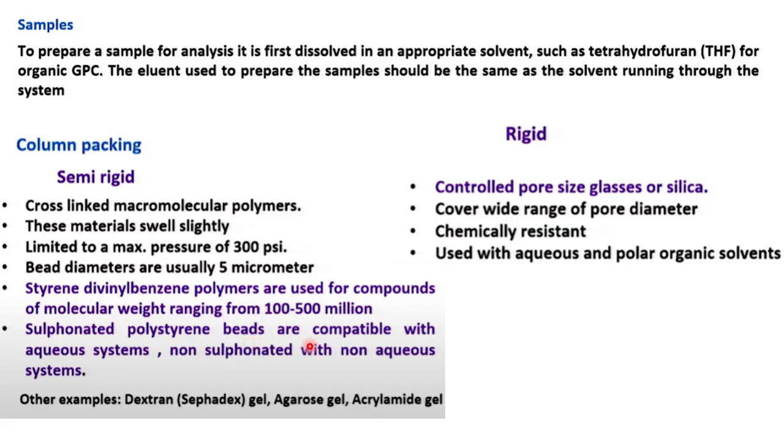Sulfonated polystyrene beads are compatible with the aqueous system, since there is a charged species, that is the sulfonated part, and non-sulfonated ones with non-aqueous systems. Other stationary phases with polymeric material are dextran gel, agarose gel, and acrylamide gel.